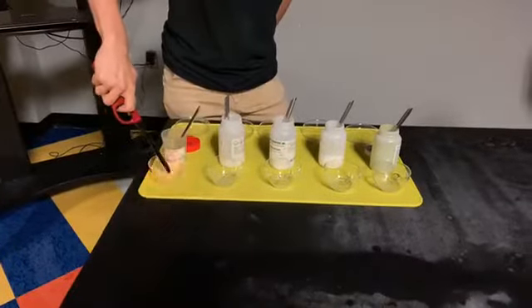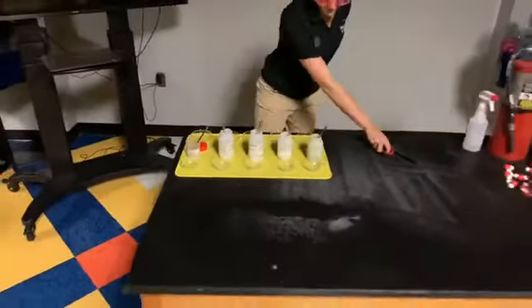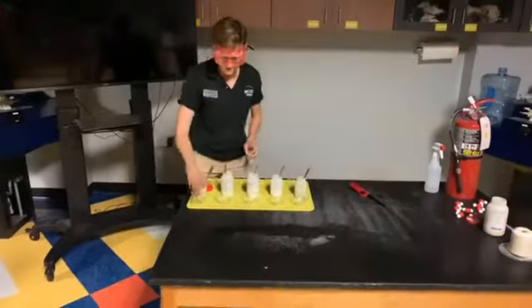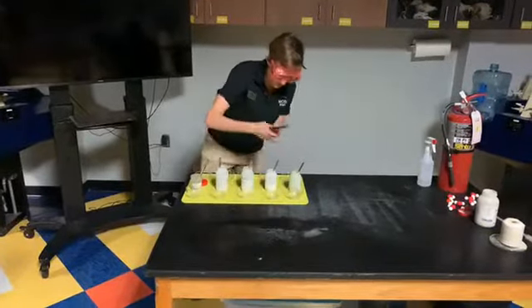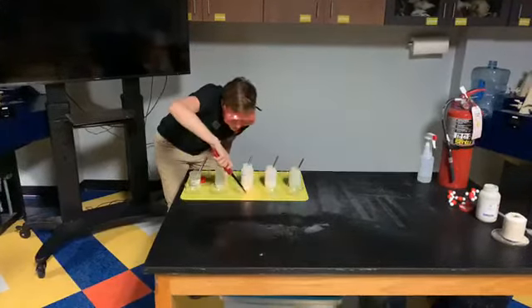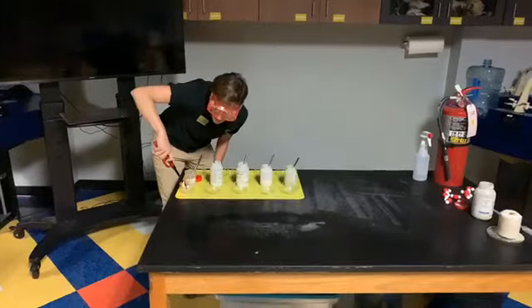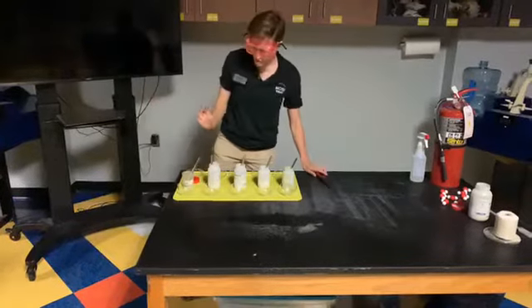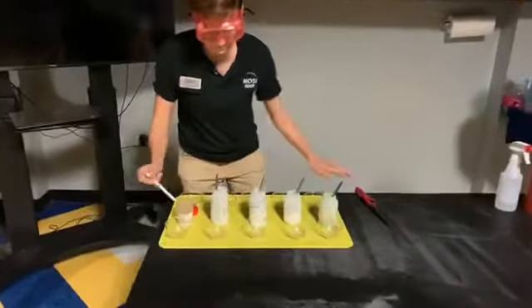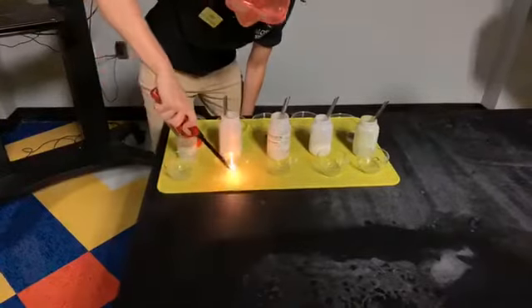And all of these experiments that I'm doing today, please, disclaimer, do not try them yourself at home. They take a lot of specialized training here. So we've got some fire in some of these. I've got a fuel source already. There we go. And what I have is a special fuel here. I might need to add a little more fuel to these so you can see them.